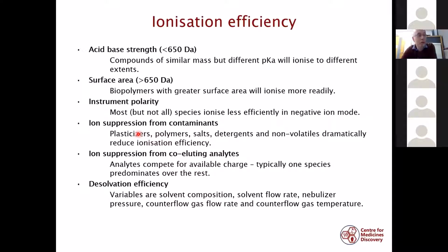We're also going to experience ion suppression from anything that coelutes with our sample. This is an issue when you're doing analysis of peptides. If you have several peptides eluting at the same time, you may find that you have a preferential signal for one over the others.